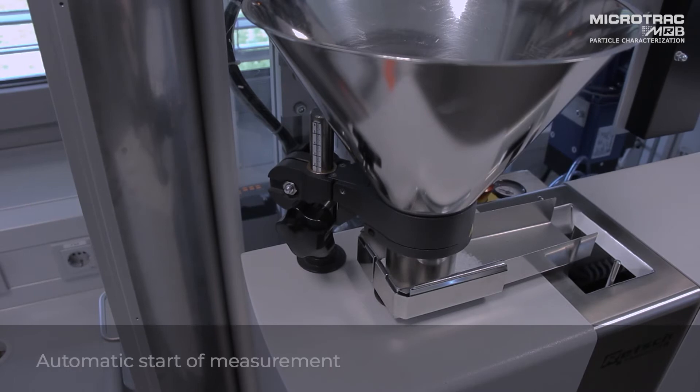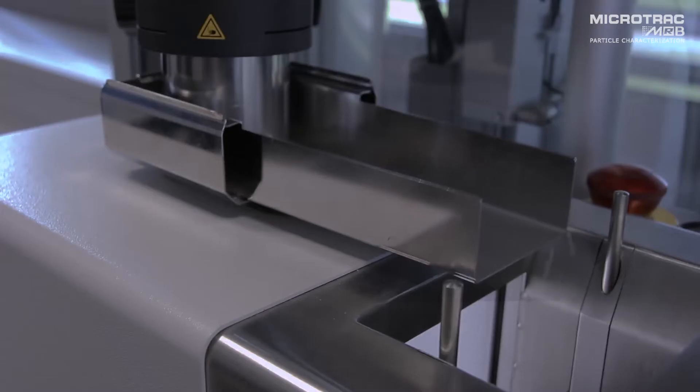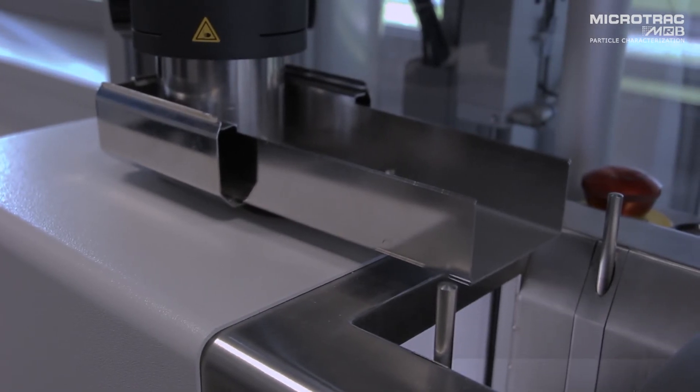The CamSizer will start automatically and we will then begin the measurement by dynamic imaging. As the sample comes to a finish, the final particles will be vibrated into the measurement chamber, the hopper.